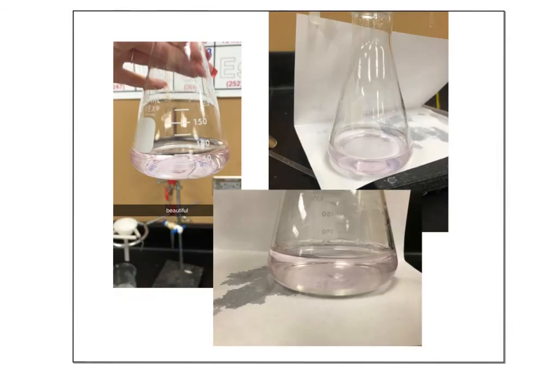And then these ones I would like to just kind of put in the Hall of Fame for our very first titration. This is pretty good for our first effort at a titration. Look at that nice baby's butt pink. Love it. That's our goal every single time, guys.